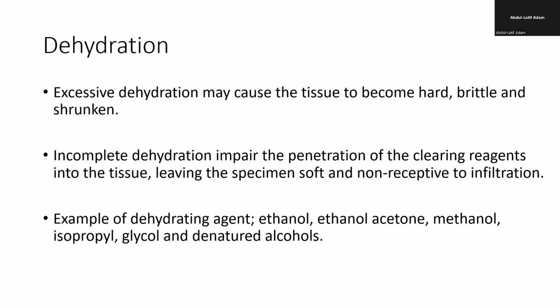Incomplete dehydration is also not good, because you are trying to remove the water. If you still have some water in there, it means that the water is still going to be there and cause distortion to the tissue. Another reason to remove all the water is that the subsequent process that is going to be done is not miscible with water. So if there is water in there, that water cannot be removed. It is only dehydrating alcohol that can remove the water.